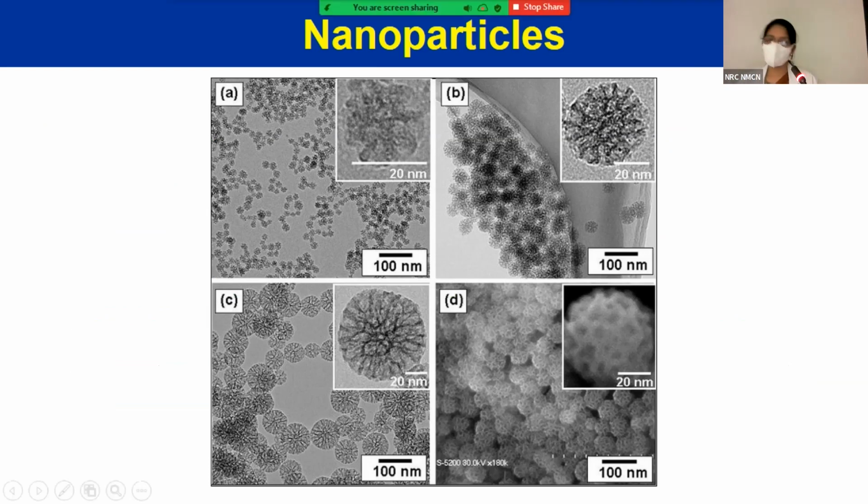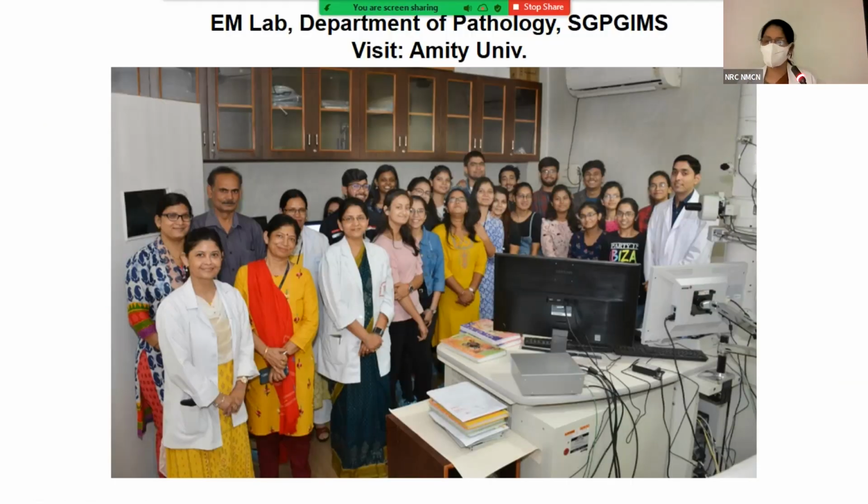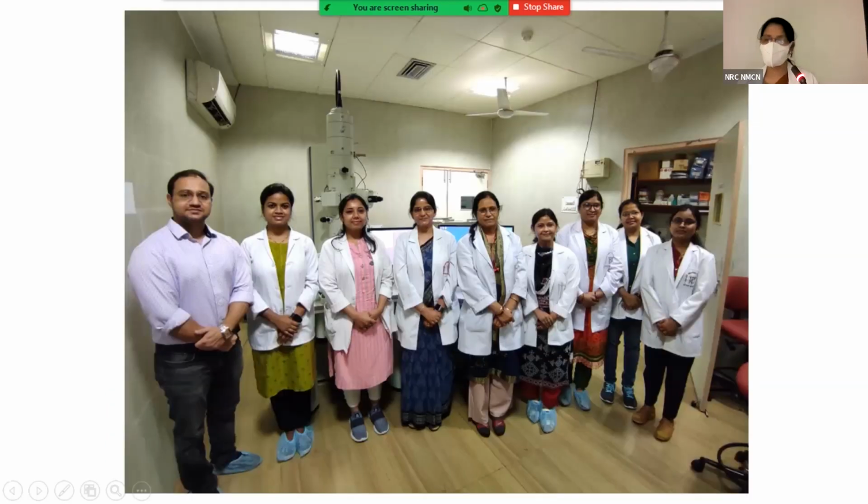Okay, so biomaterial things. We keep on having students from the universities who keep coming for visualizing. And this is our electron microscope. This is a column, and this is our team in electron microscopy. Our technician Madhulika, Parat, and some of my peers. Okay, any questions?